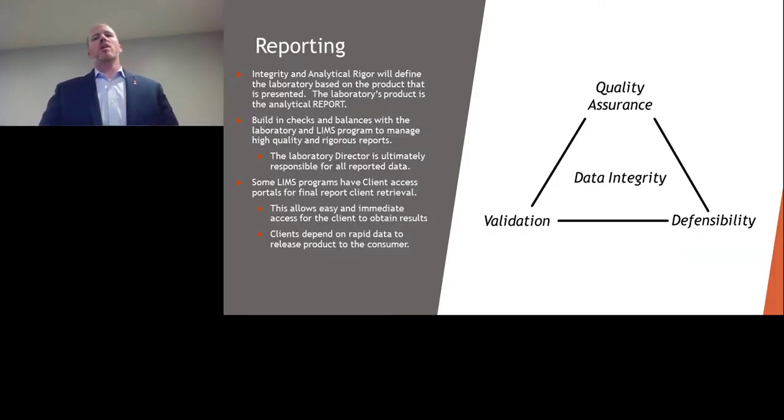So once you get all your data and everything is in a form that you're ready to present to your client, this is where you get to the reporting portion. The heart of your lab is the report itself. That is what you are producing. You are not producing numbers. You're not producing a widget. You are producing a report.